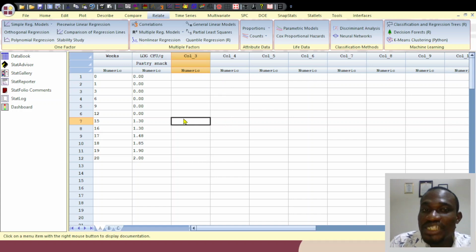If I have batches of the same products that I'm testing, I can put those results for the second batch in this slot. And the LSL is the lower specification limit. So for some samples, you would have a lower specification limit and then an upper one.